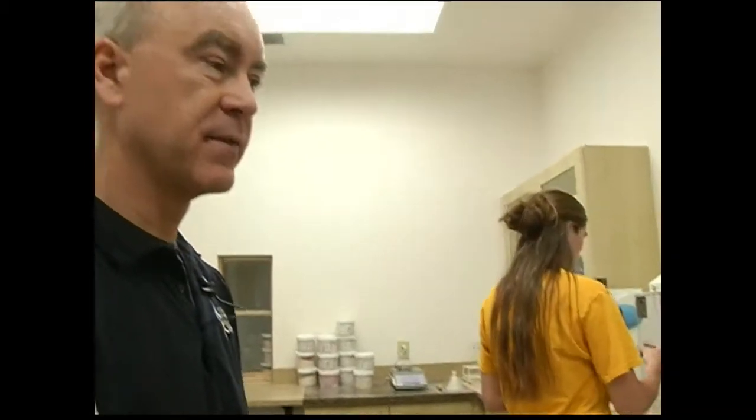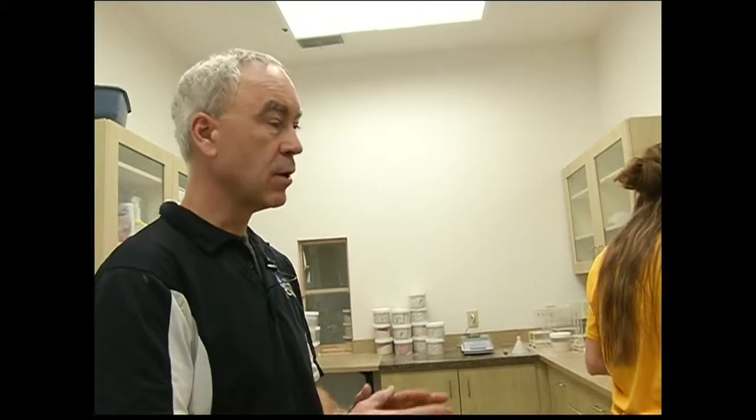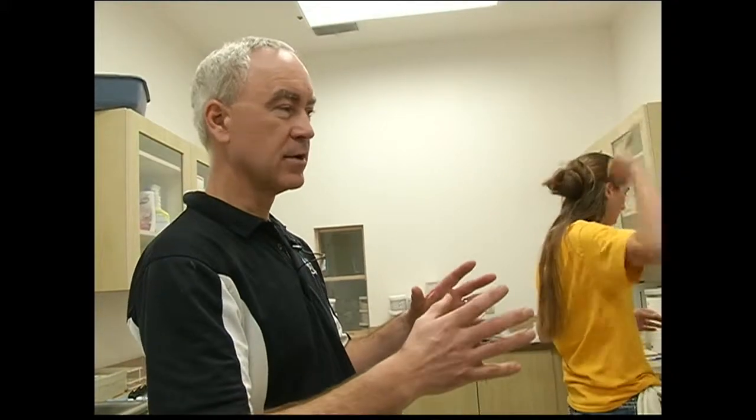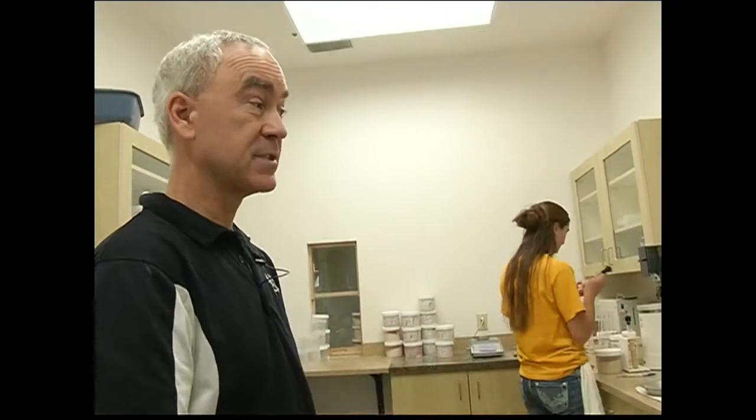This test was developed over 50 years ago, and it's a measure of sprout damage that occurs in wheat. Under normal conditions, producers are out in their field, combining their wheat and hauling it to the bin, and everything is high and dry, and the grain is in perfect condition. Unfortunately, usually at some point in some place in Montana, wheat is rained on during harvest. And those little kernels of wheat think that it's time to grow because they've gotten wet. And that's what this test is going to measure.